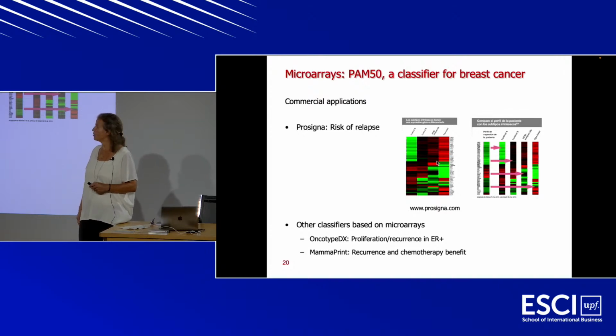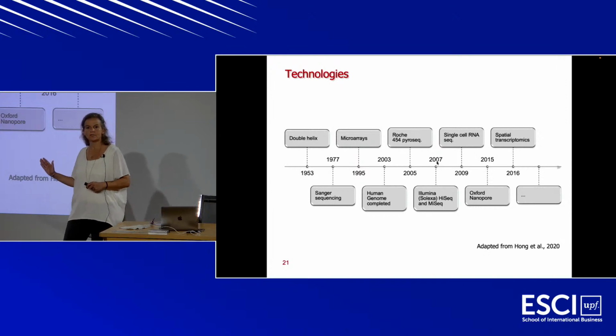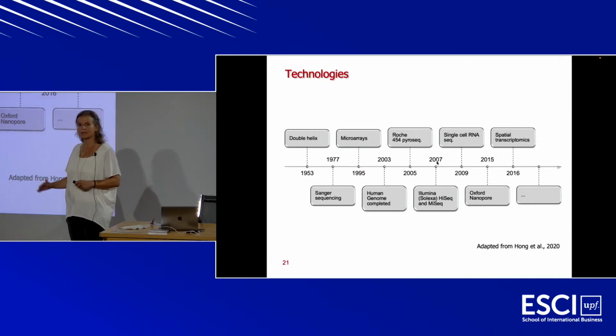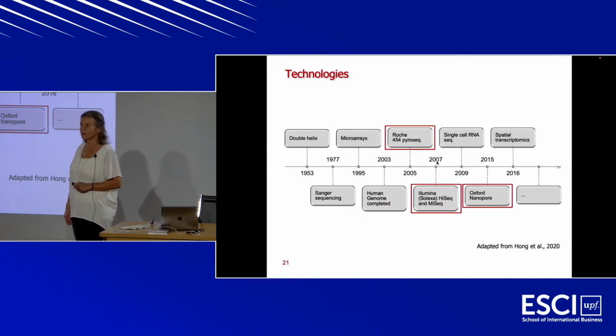So a lot of this research that we perform in microarrays and in the other transcriptomics technologies will have an impact on the clinic. So let's focus now on the sequencing technology, RNA sequencing, which some of you didn't know what it is.